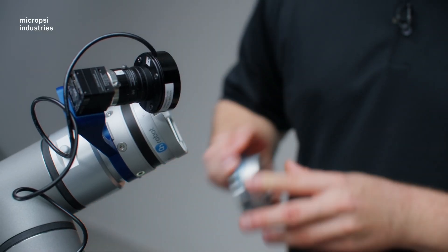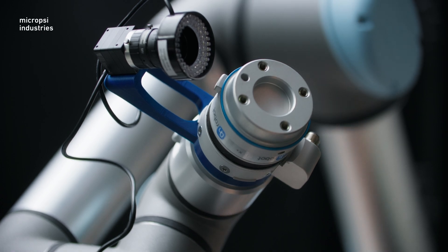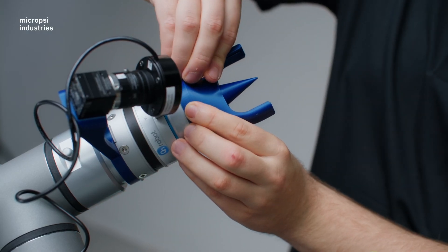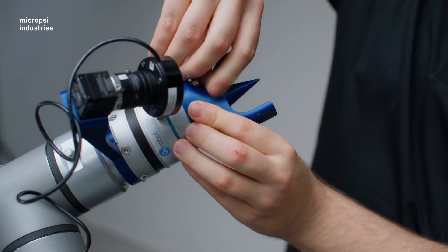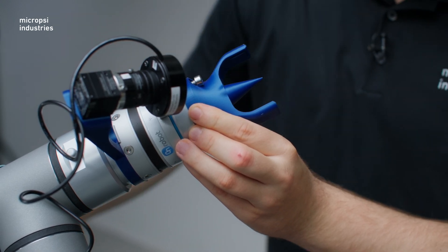All that's left is to attach the gripper — this is where you would mount any other kind of end effector you have. Here, we attach the toolset quickchanger, and we can then mount the gripper. The gripper should be oriented parallel with the camera.